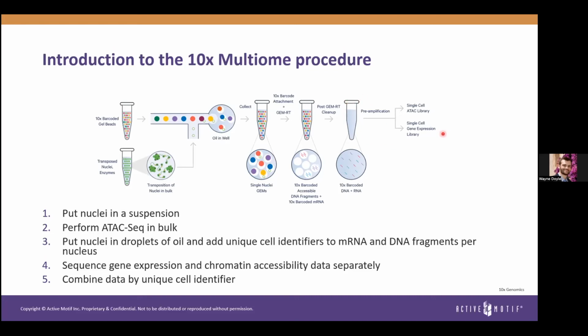After we've finished the wet lab procedure, we then perform sequencing, where we sequence the ATAC-Seq library and the gene expression library separately, and then we do a computational analysis to combine them.